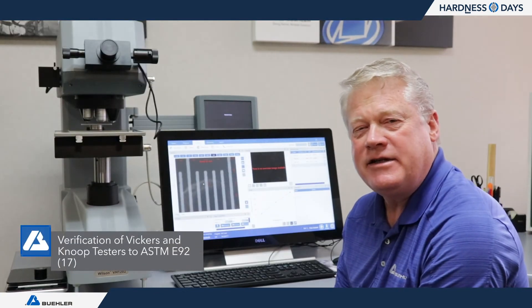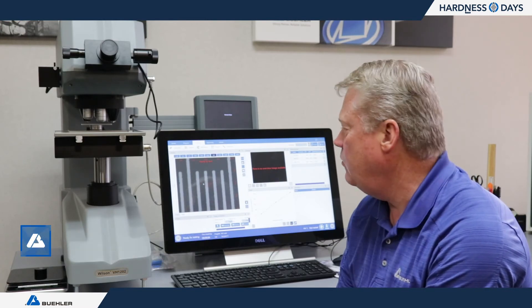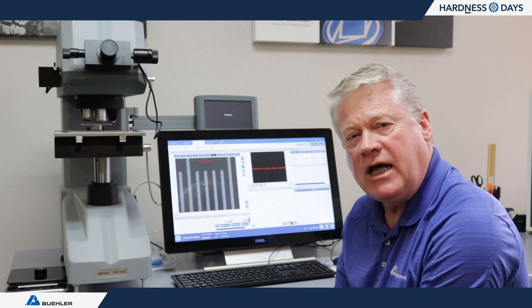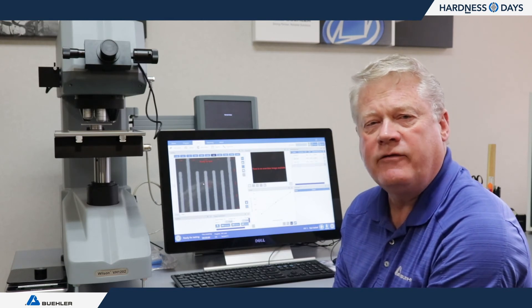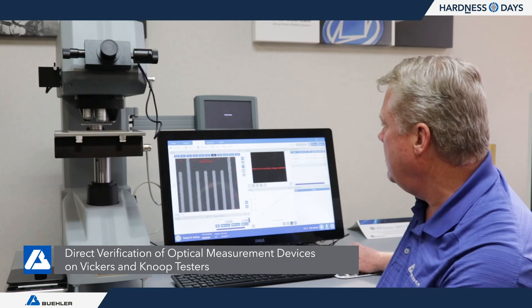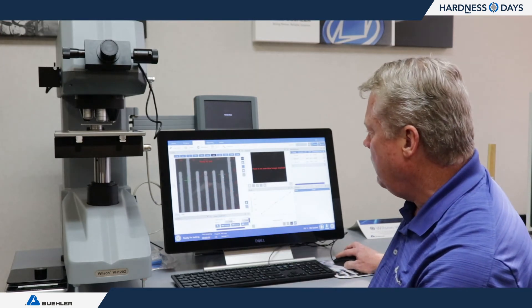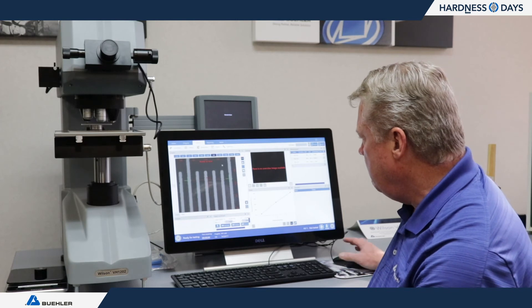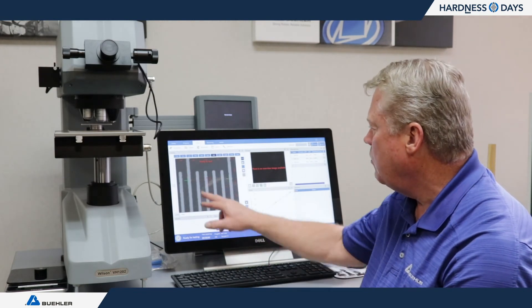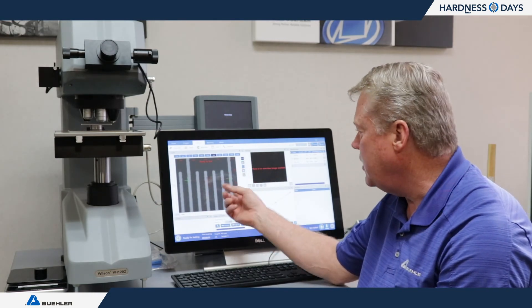Moving on to E92, which is the ASTM standard for micro-indentation testing, there are two parameters to verify using the direct method: the measuring device and the forces. We can also check indenter contact velocity, but it's generally not required for a normal direct verification. Using a glass stage micrometer on the microscope, we measure a 100-micron distance — it's coming in at 100.5 microns. We do this for each objective to verify each one measures correctly for each zoom step.